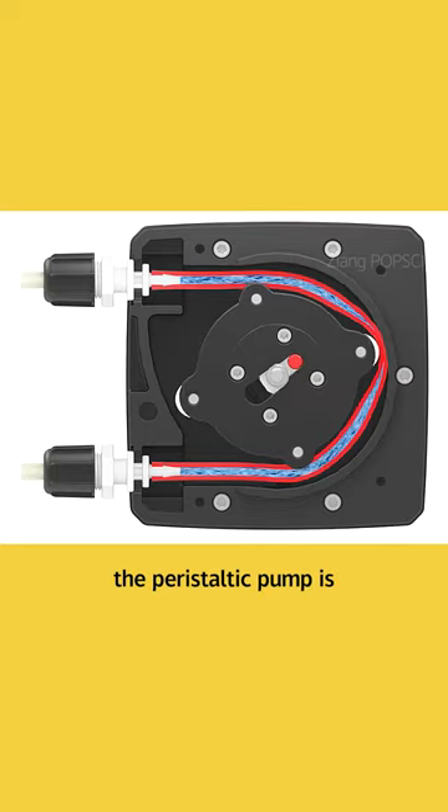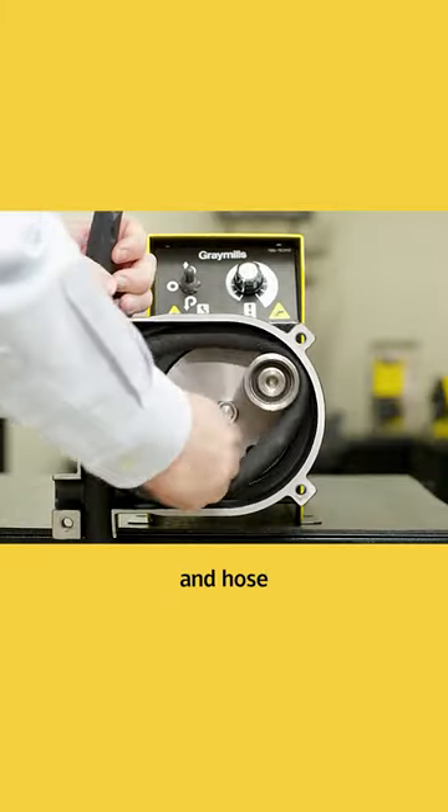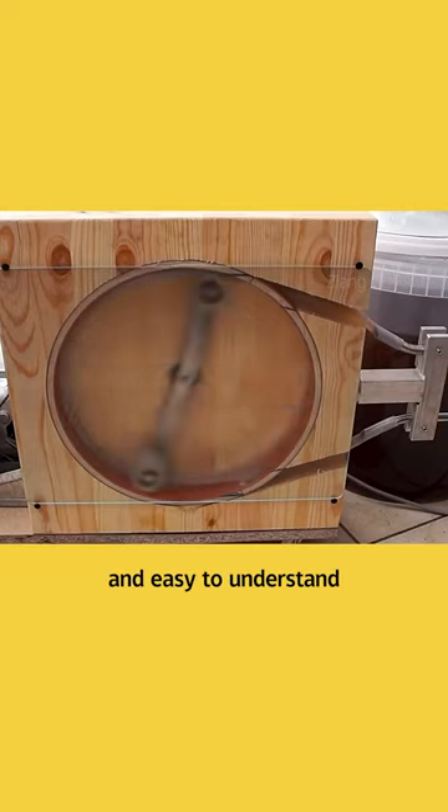The mechanical structure of the peristaltic pump is very simple, mainly composed of a driver, pump head, and hose. The working principle is also simple and easy to understand.